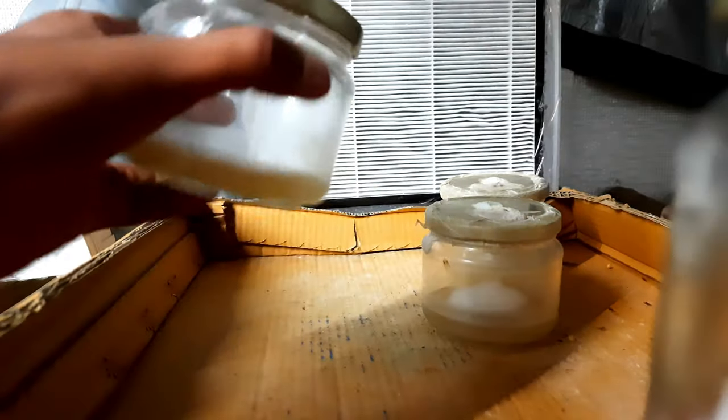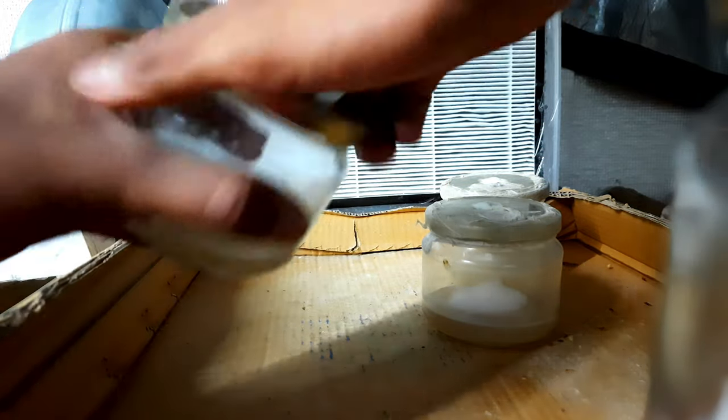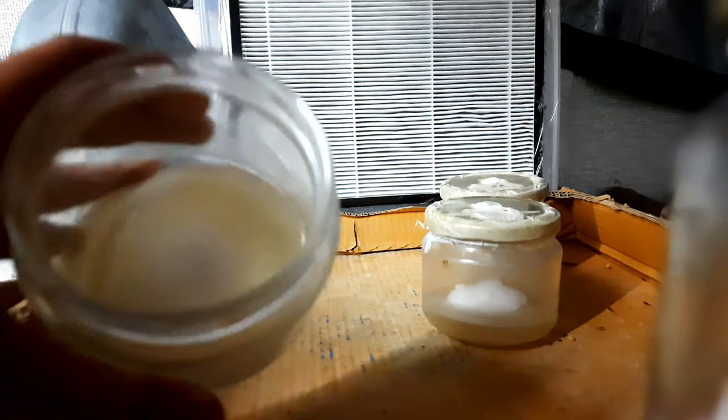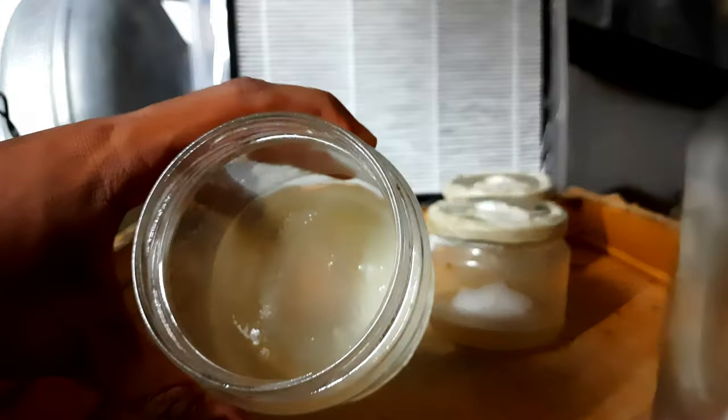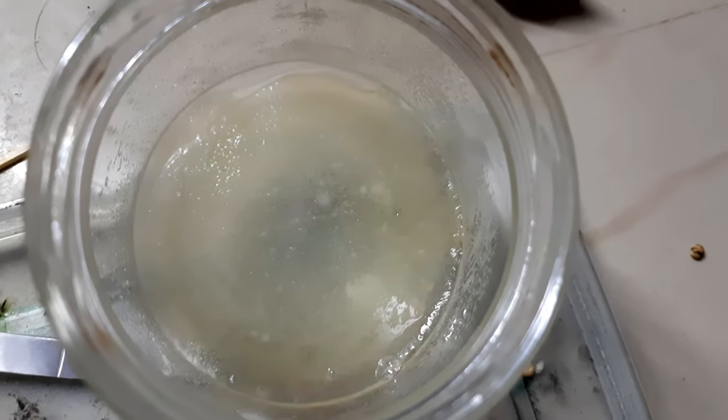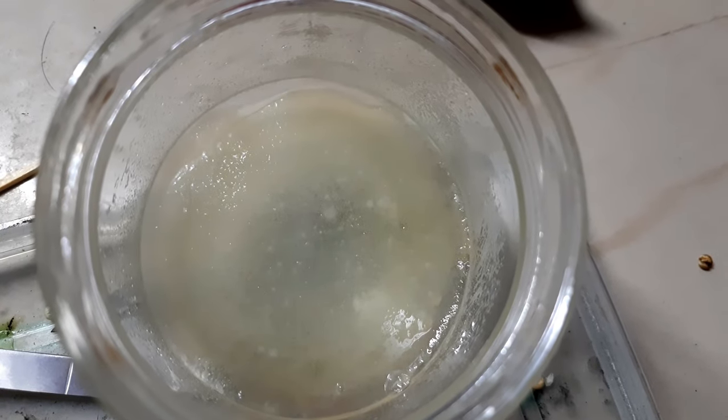It's been a day since we made the agar plates. It's not very clear in the video so I'm going to show you on a photo. As you can see, some small colonies of bacteria have grown.